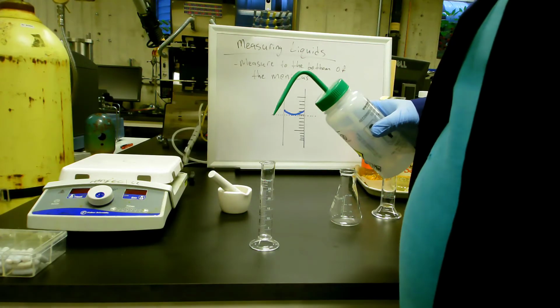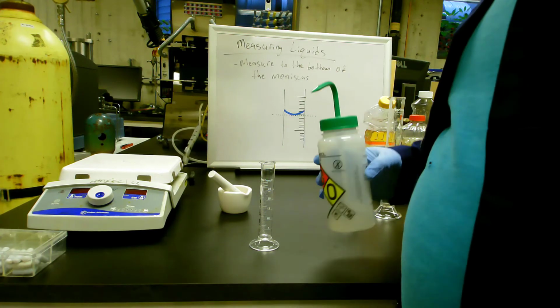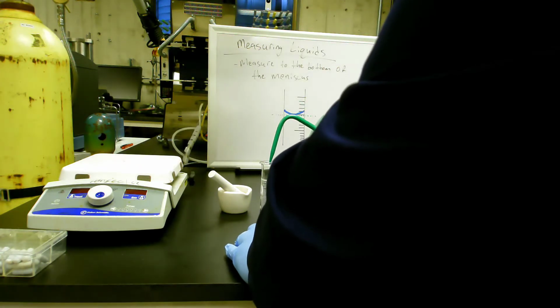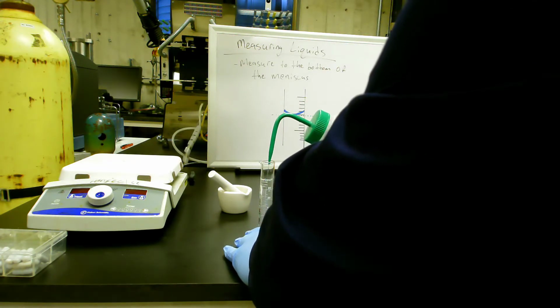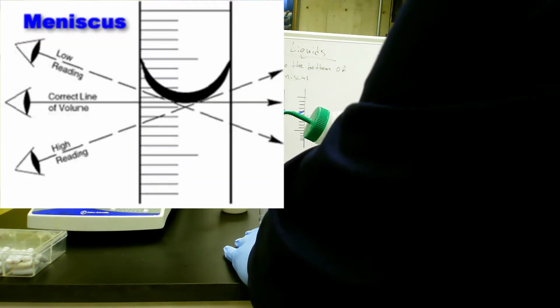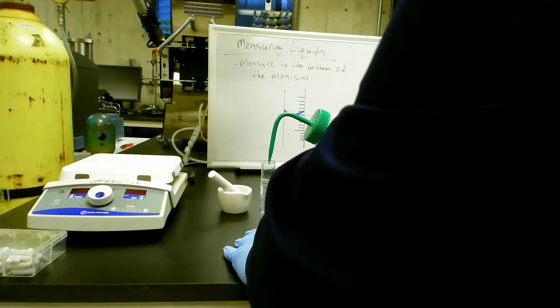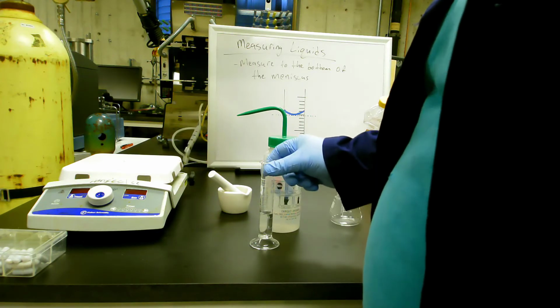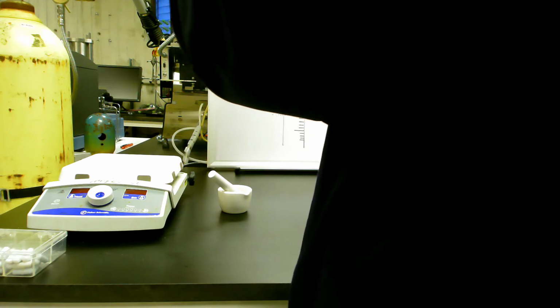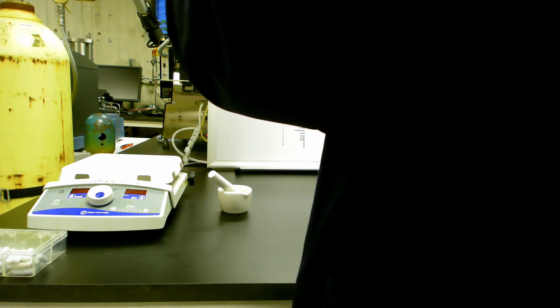In this step, we're going to measure out our methanol into the 25 milliliter graduated cylinder. We need to measure out 14 milliliters of methanol. When measuring liquids, it's important to measure to the bottom of the meniscus. The meniscus is a concave shape that forms when the liquid sticks to the side of the glass. You can see it with most liquids, and it is dependent on the surface tension the liquid has. So methanol gives you less of a meniscus, although it is visible. Water or something like that gives you quite a large meniscus.